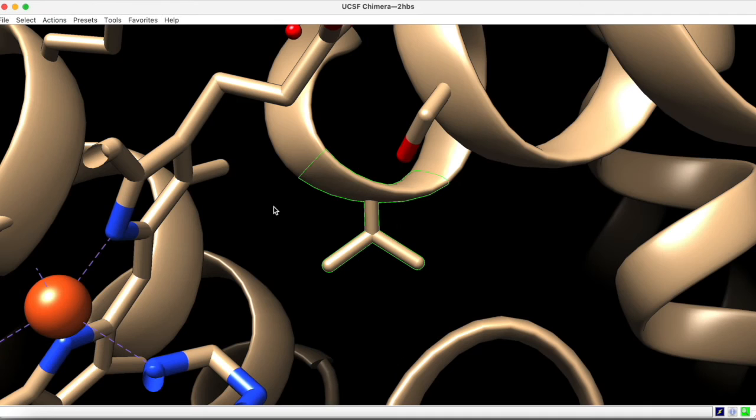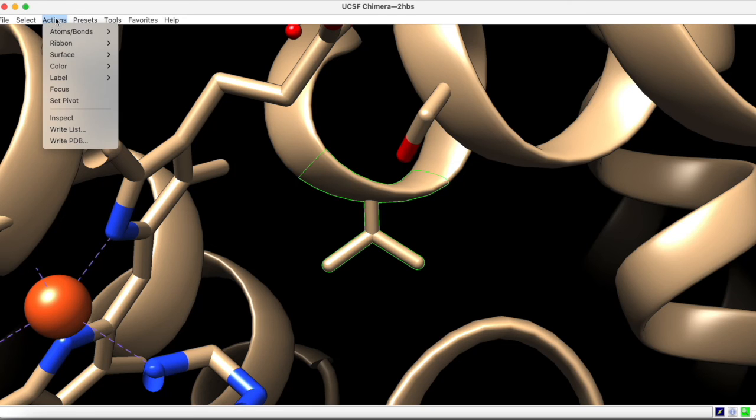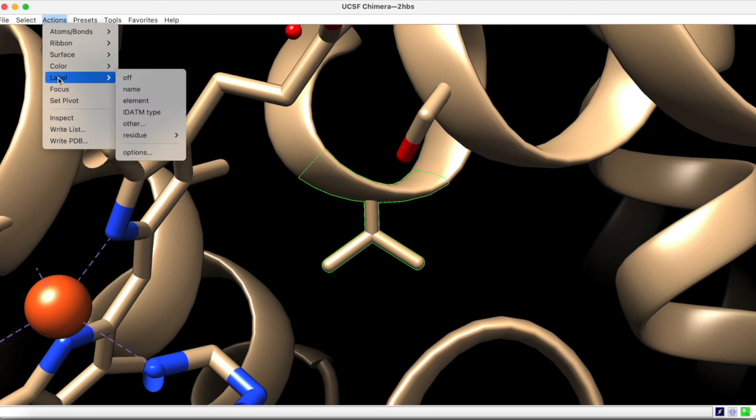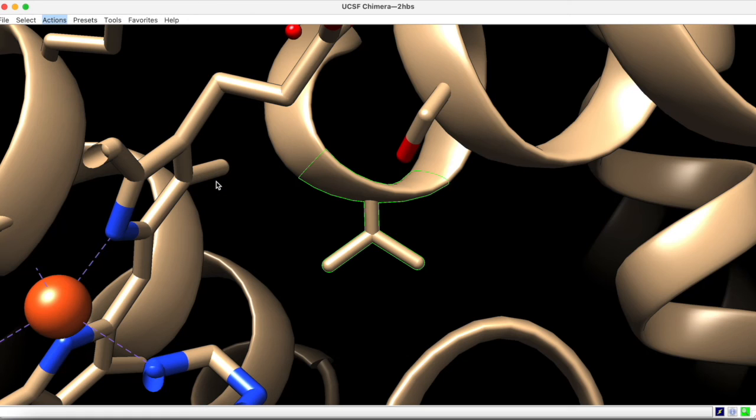Once you have obtained a clear view of the residue, you may want to label it. To do this, go to actions, label, residue, and choose name plus specifier.